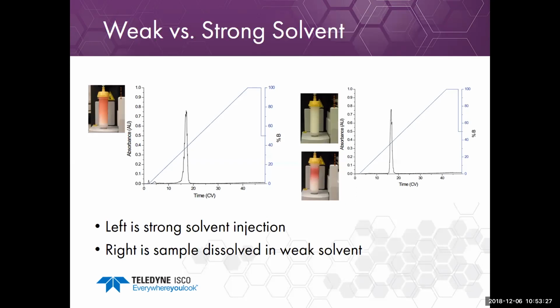Okay, and this will be the final question here coming in right now. I have a compound that is charged but very hydrophobic. It's best run on C8 column with water and acetonitrile as a solvent. What should we do when we run this on C18?